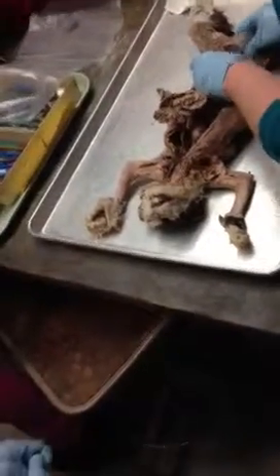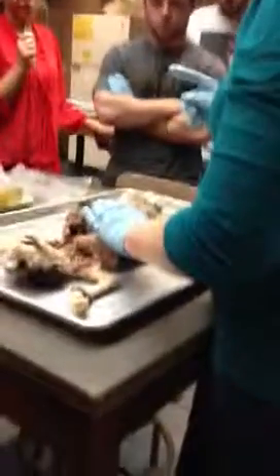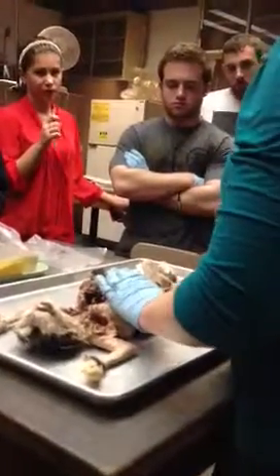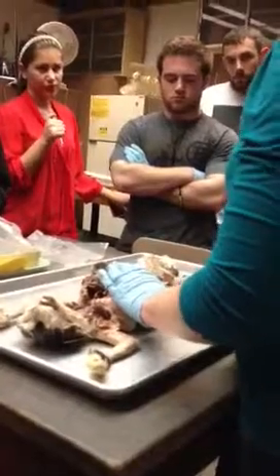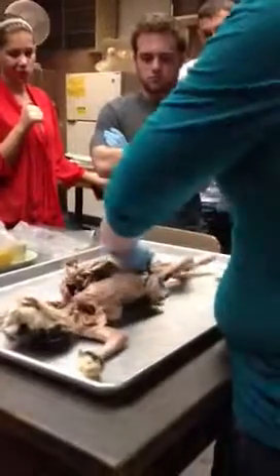Okay. Now, female anatomy in the human, we have separate openings for reproductive and urinary system. Cats have one. So juvenile males and females look exactly the same because they both only have two openings, the rectum and then their urogenital opening. Okay. So until the testes fall, you can't tell male or female kitten apart. Okay. In order to see this, we're going to cut through the pubic symphysis. Remember, it's just cartilage, so I can actually do it with a pair of scissors. And again, when you do this, be cautious of the bone.